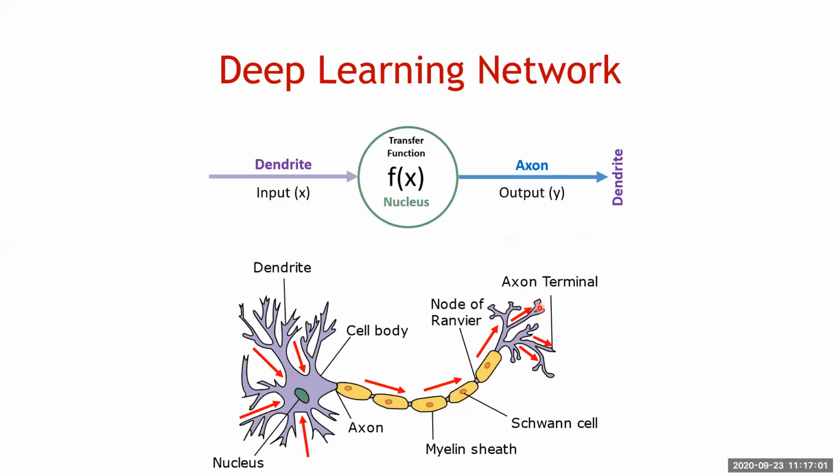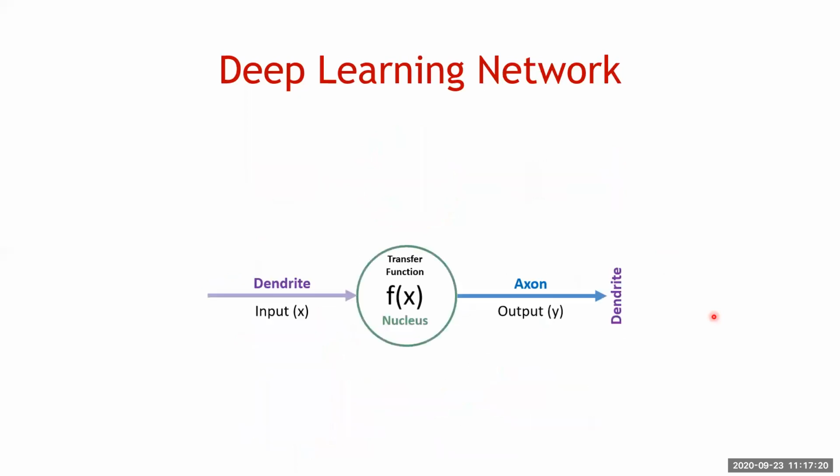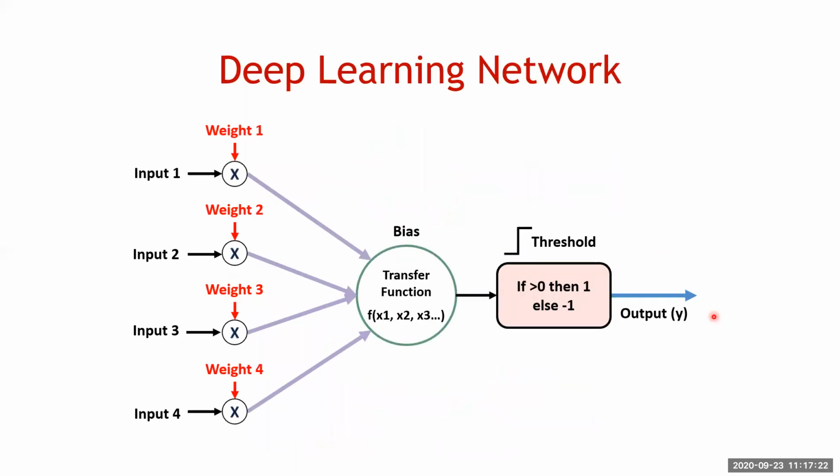You have to realize, as the picture suggests, there's a lot of input that can come in, not just one, with many dendritic spines and processes, and then you have a lot of these connecting up with a bunch more dendrites. In the background, what's really there is a schematic picture like this, but you never see it because there's just too much there, and it gets simplified to what I showed before.